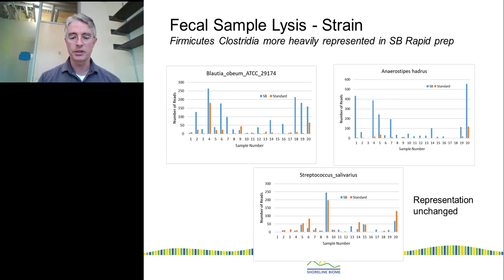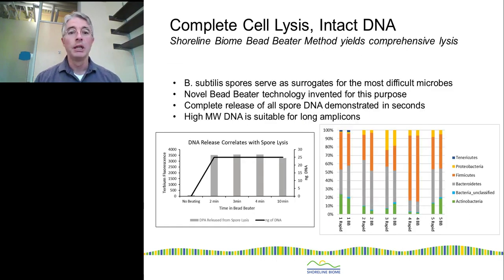The catch with the physical is that we wanted to be able to recover spores. Why spores? Spores are really hard to crack open without destroying the DNA. Many of the methods that you can use to completely destroy regular cells don't even touch spores. And that was the case here. This is where our collaboration with Dr. Setlow's lab came in.